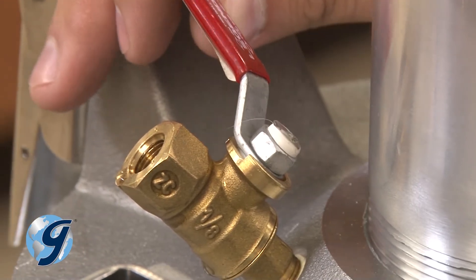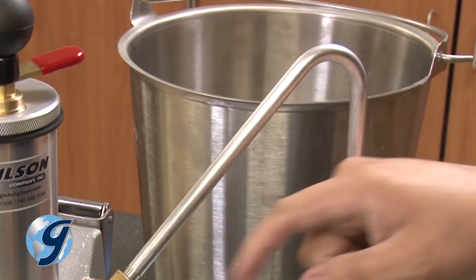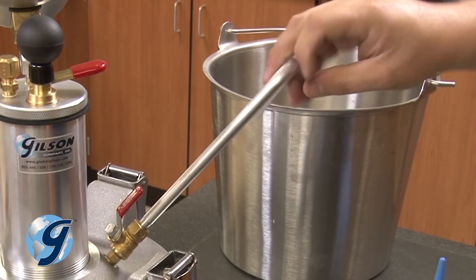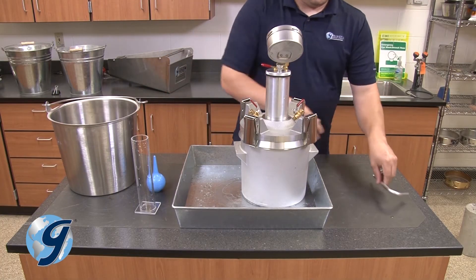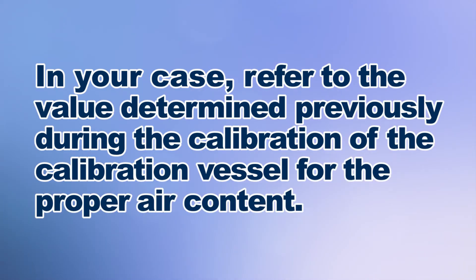Now open the opposing petcock to allow water from the bent calibration tube back into the base. Once the water flows back into the base, we can remove the bent calibration tube and set it aside. The air content in the sample chamber is now at the value determined by the calibration of the calibration vessel, nominally 5%. In your case, refer to the value determined previously during the calibration of the calibration vessel for the proper air content.